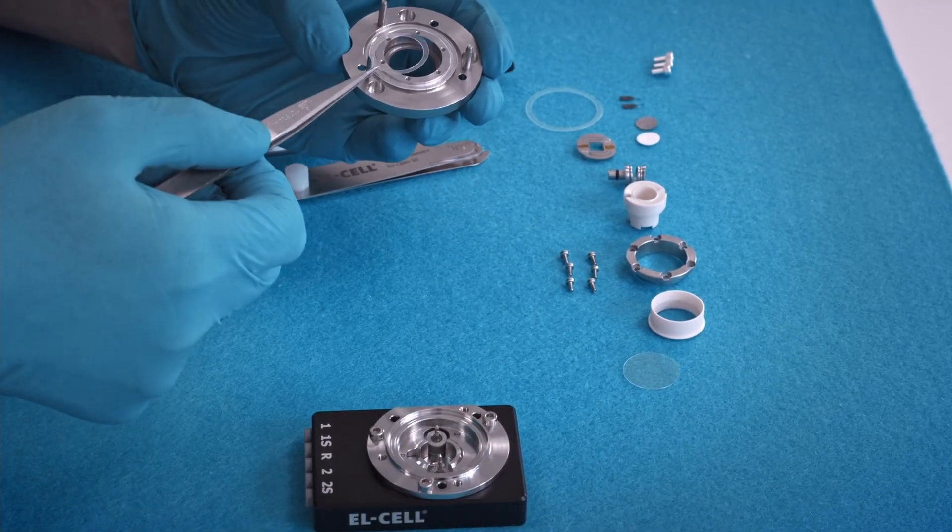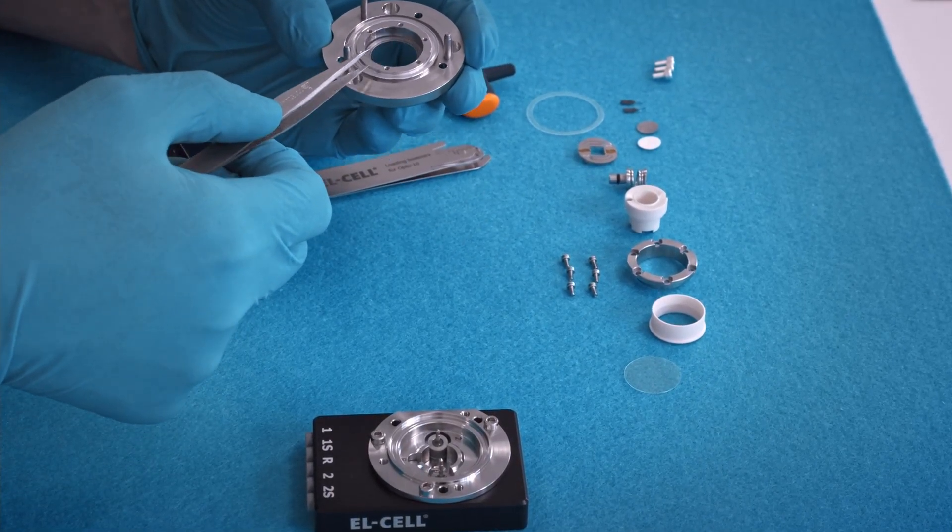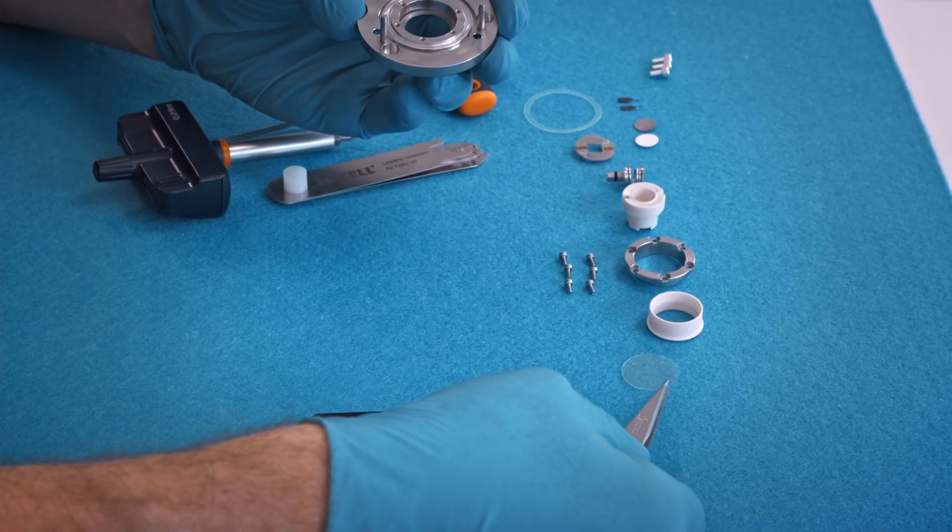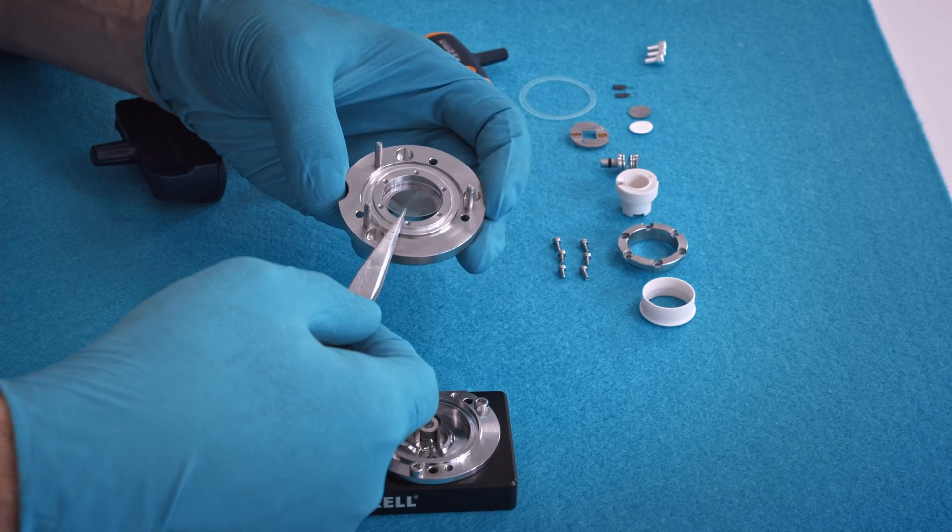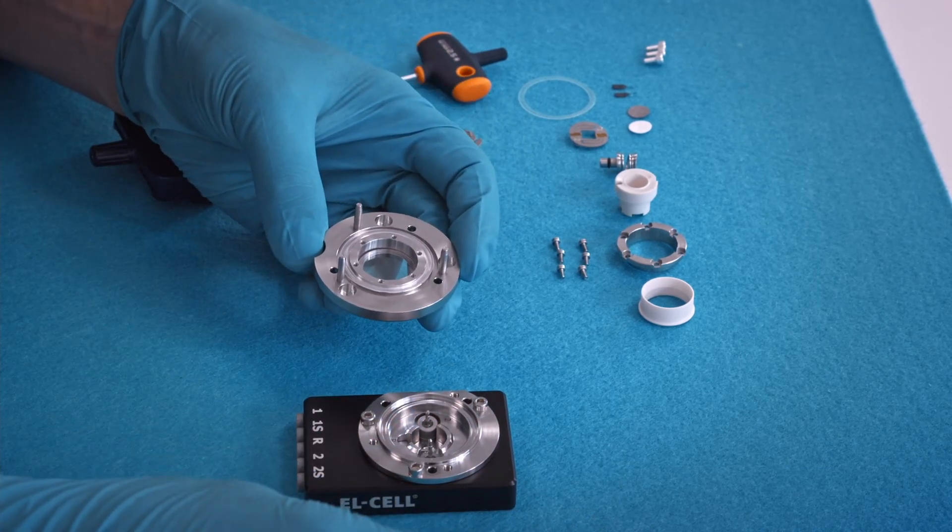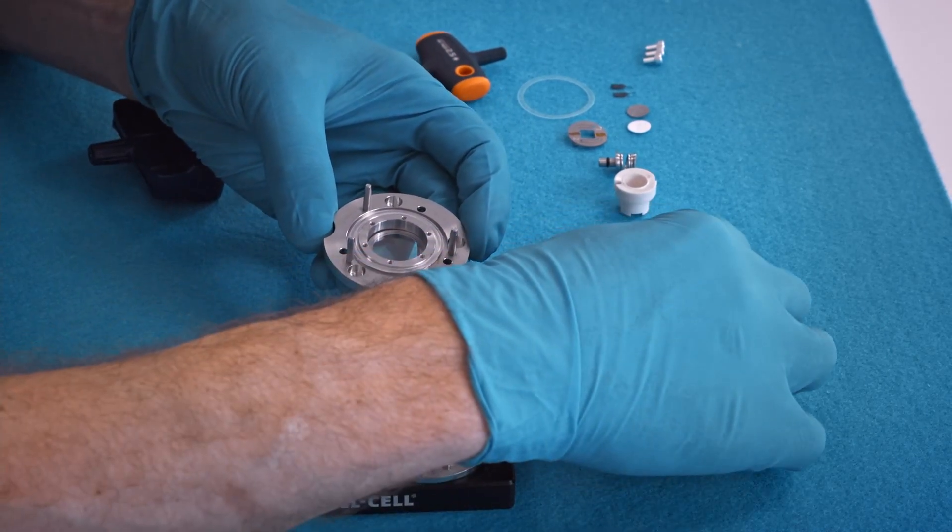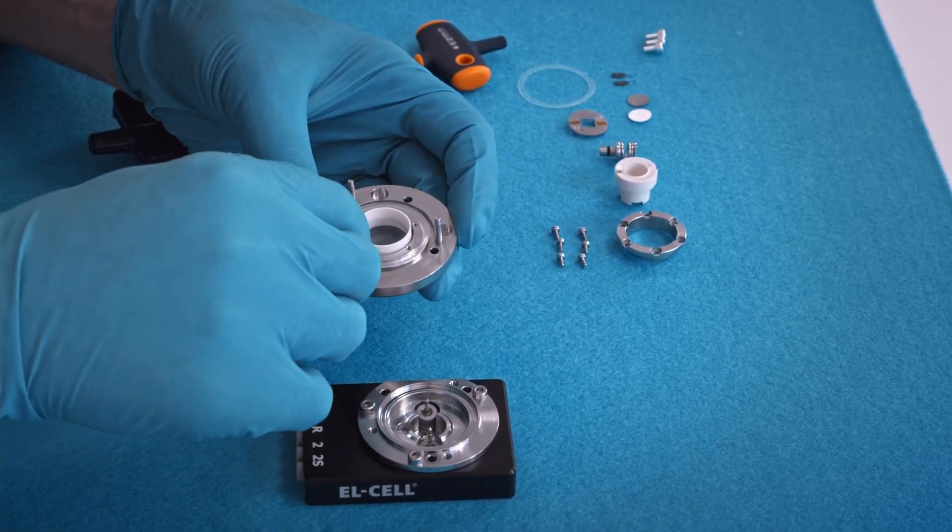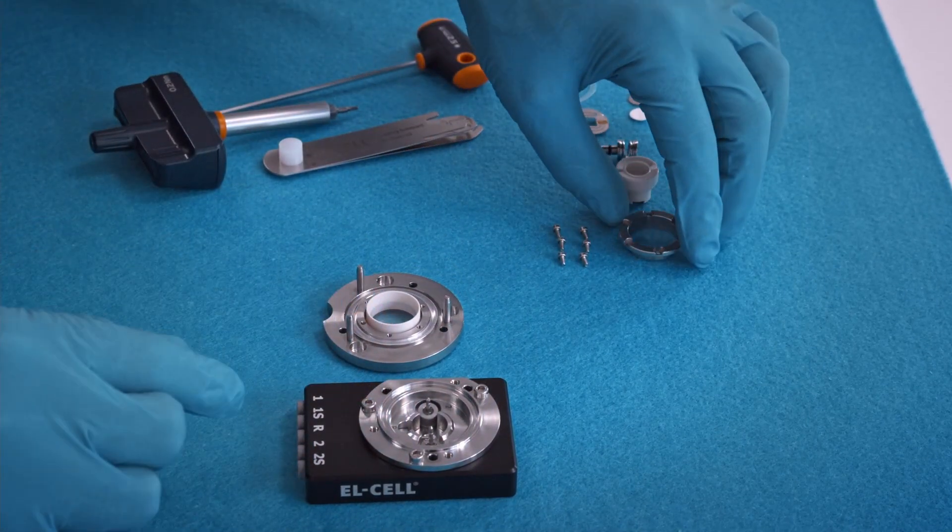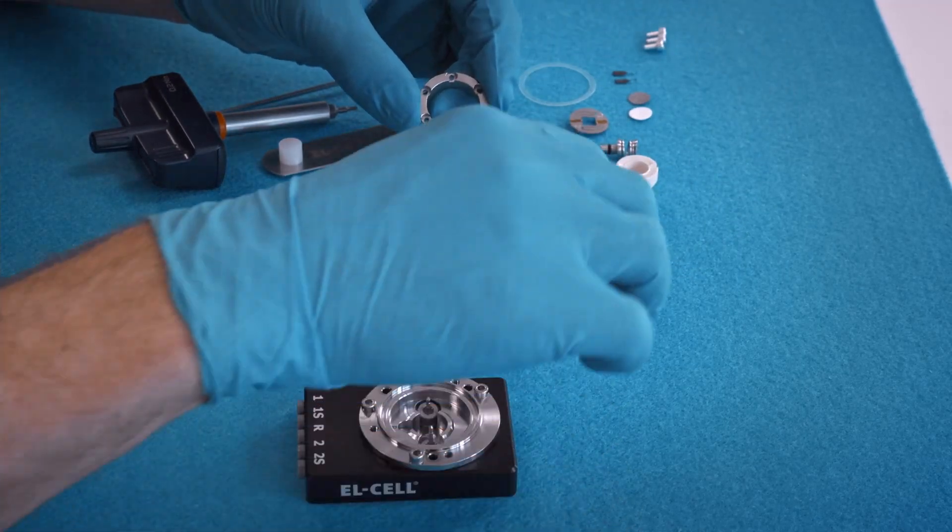Put the seal into the lid, then on top the window, sapphire window in this case. Insert this plastic sleeve, then attach the flange with the provided screws.